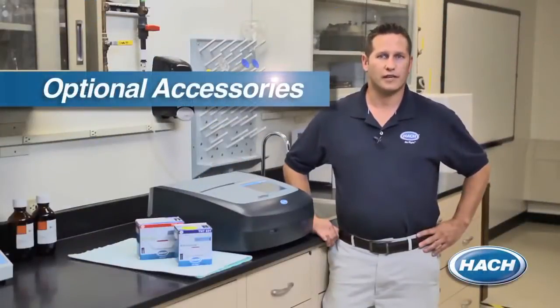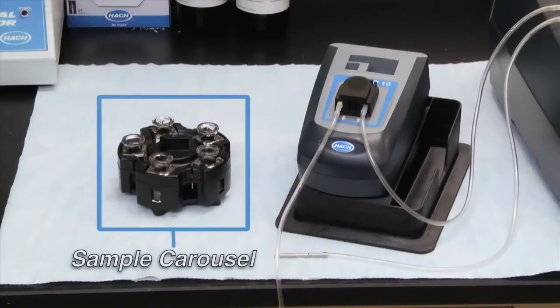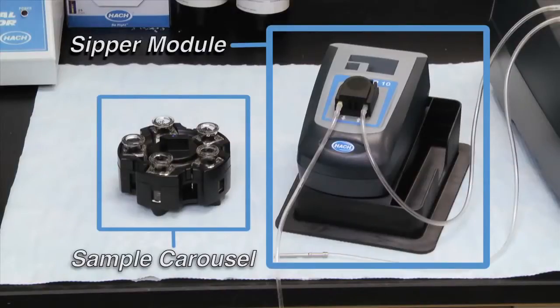By using one of Hach's sample carousels with the DR6000, you have the ability to perform a high volume of repeat samples. And if you need a defined, fast liquid flow that is air bubble free for generating highly accurate results, a Hach sipper system can be used with this instrument to ensure optical errors are eliminated.